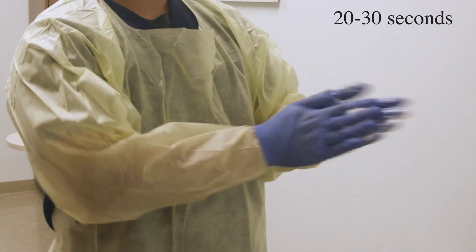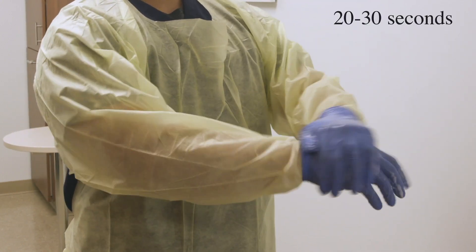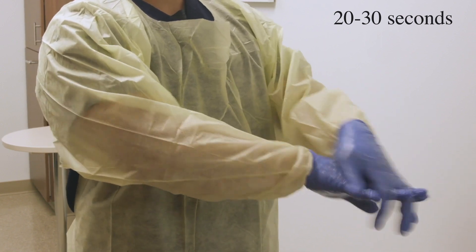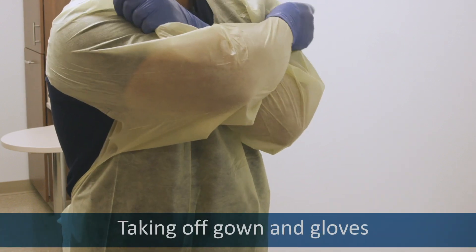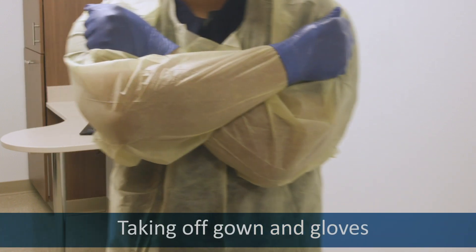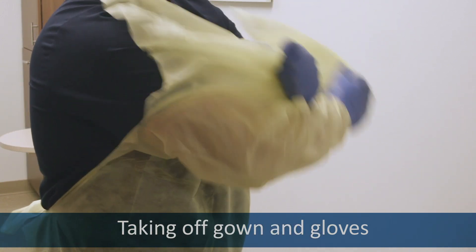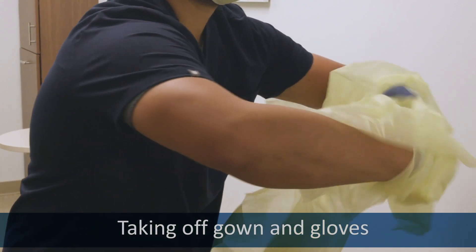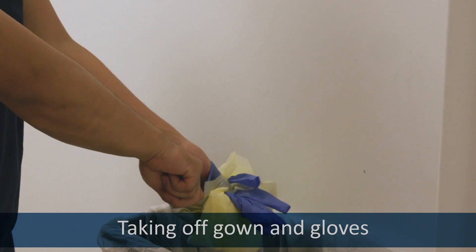Sanitize your gloves very well. Get your fingertips and thumbs and in between all of your fingers. To remove the gown, cross your arms and grab the shoulders of your gown. Pull until you feel it break, then roll it away from you into a ball and over your hands until you remove the gloves.